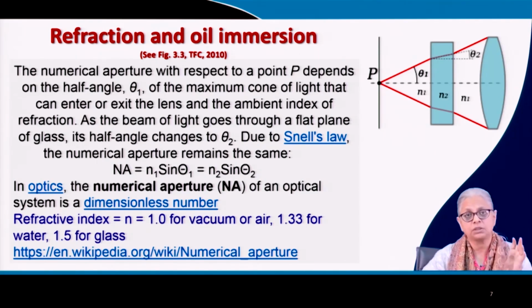All oils will not have the same refractive index as glass. So immersion oil is something that is specific for microscopy. And the second thing is 1.33 is the refractive index for water. So if you don't have immersion oil, you can use water. Water will give you better results than air, less than oil, but better than air.